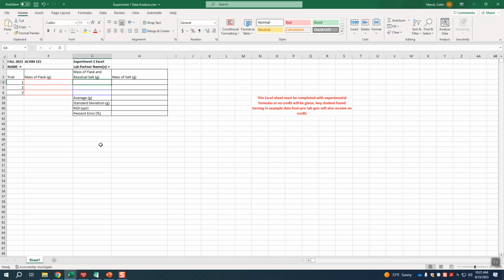So you're going to put 5 milliliters in it, put it on the hot plate, and boil off the water, and the salt will remain. You'll literally see the salt in the flask. So there'll be some salt in the bottom of the flask. Then you'll weigh it again, and you'll get a new mass. This mass should be 0.15 grams higher than this mass. Why? Because you're boiling off 5 milliliters of salt water, and it's a 3% solution, so it should have 0.15 grams of salt in it. All right, so that is basically how this works.